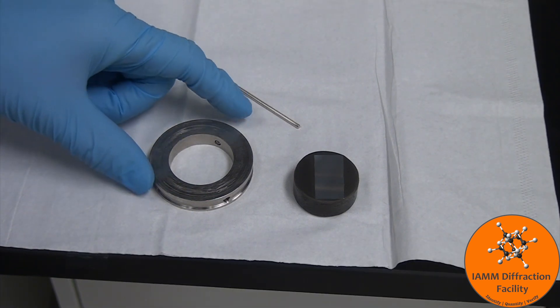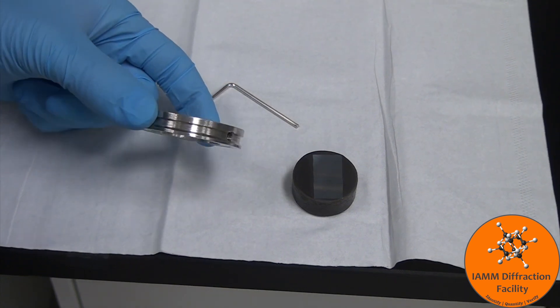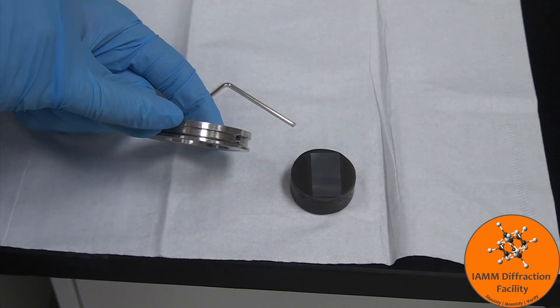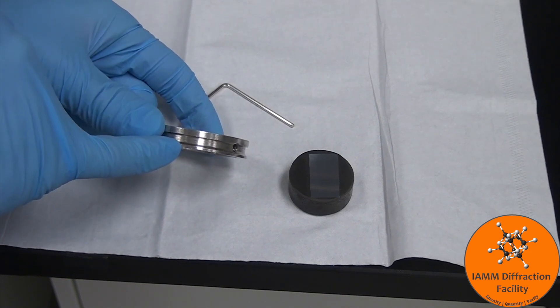The first thing to point out is that it is very important to know the orientation of the sample holder. You'll notice that there is a thicker section up top and a thinner section on the bottom.